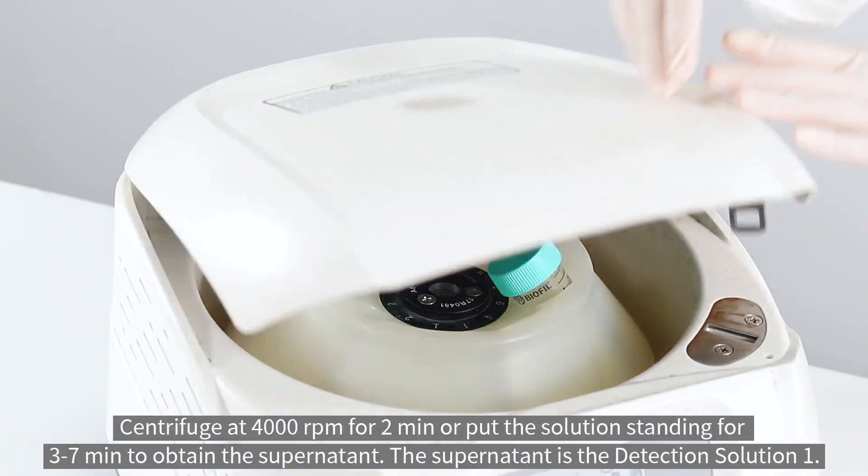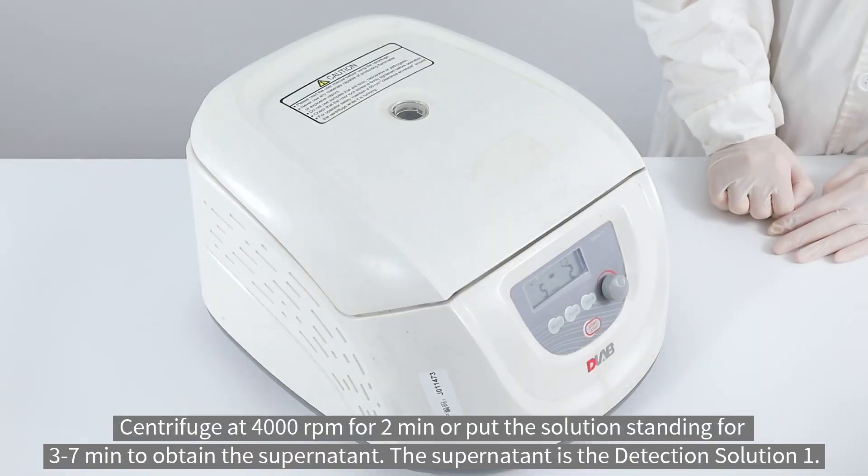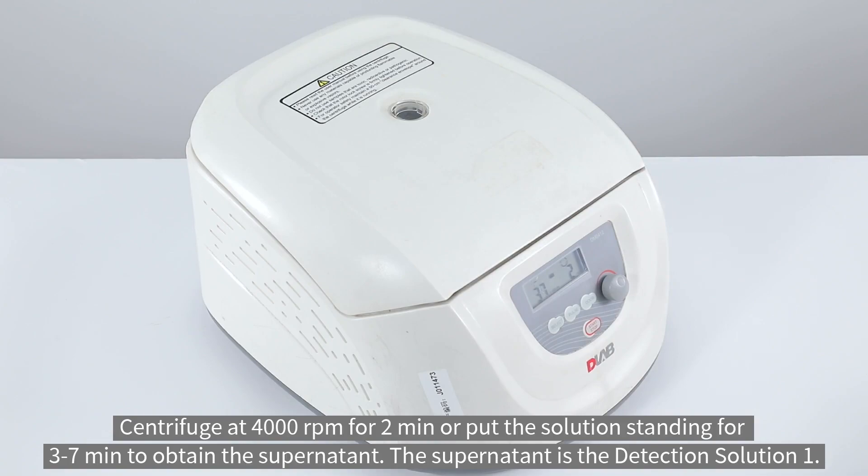Centrifuge at 4000 revolutions per minute for two minutes, or let the solution stand for 3 to 7 minutes to obtain the supernatant. The supernatant is the detection solution.